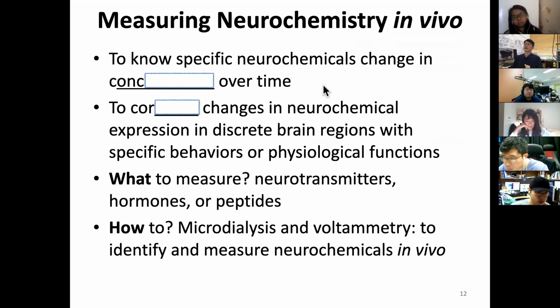All right, so now I'm going to talk about neurochemistry in vivo, to know specific neurochemical changes over time.